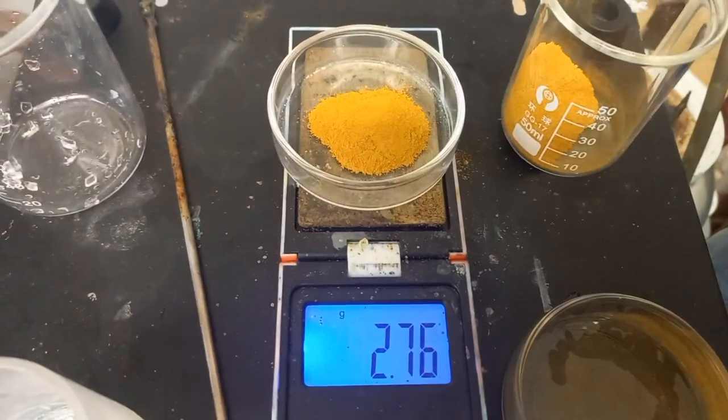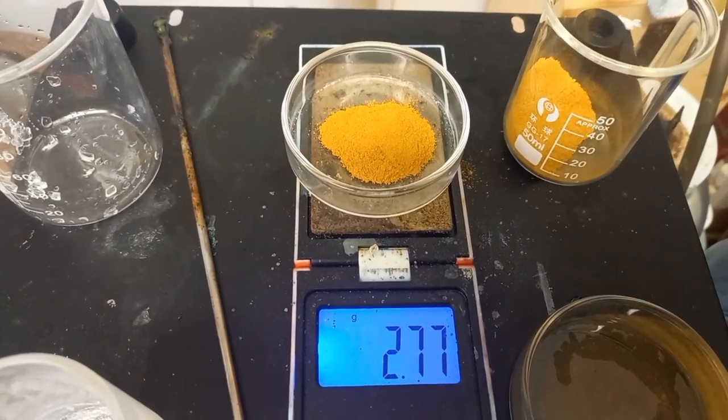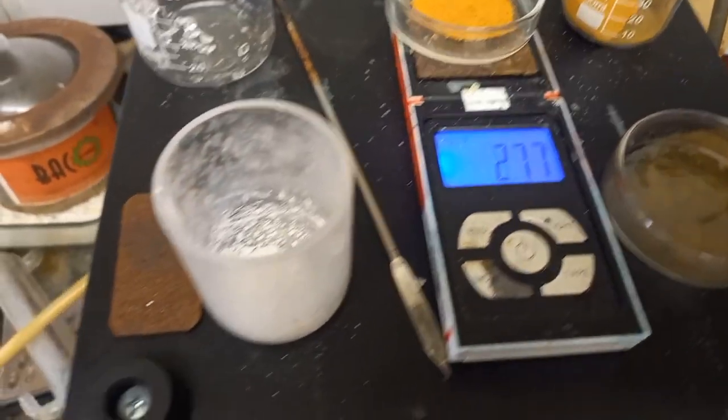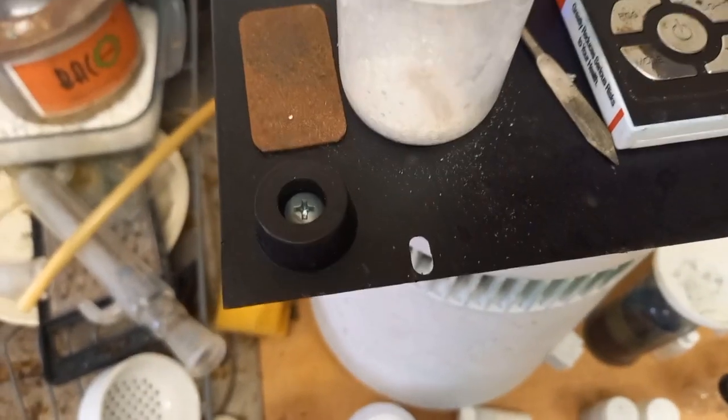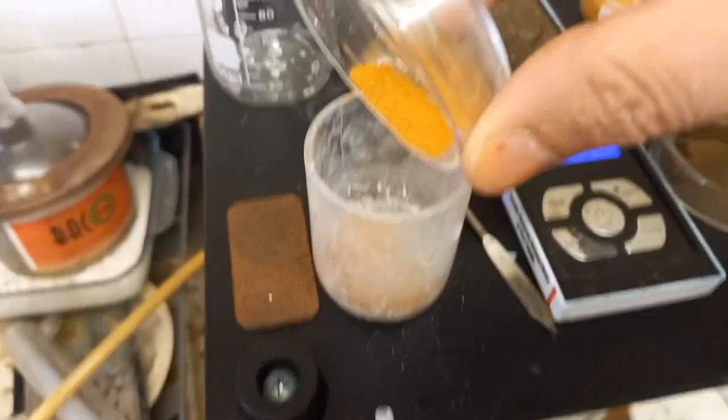We want 2.7 grams vanadium pentoxide to mix with 4 grams bismuth trioxide.